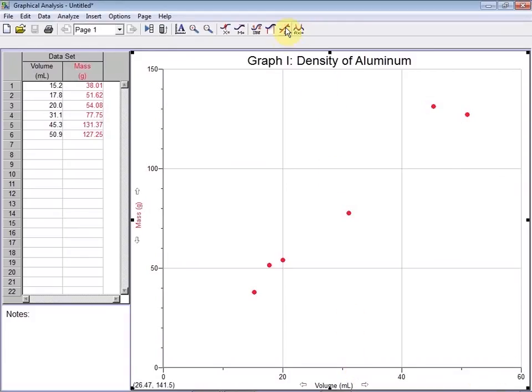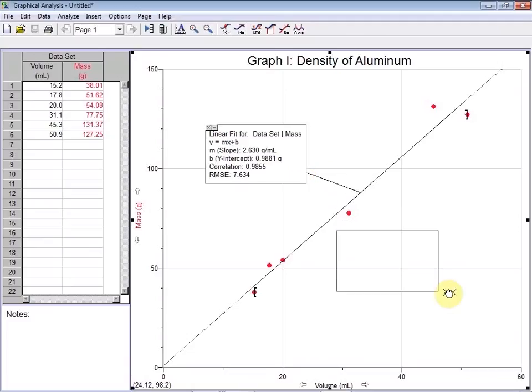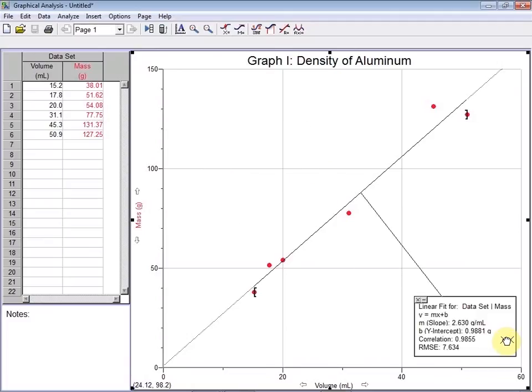By clicking up here on this linear fit icon, the software automatically does a linear regression line for all the plotted data. This box here with equation information can be moved to a more desirable location as well. Let's put it over here in the corner so it's out of the way.